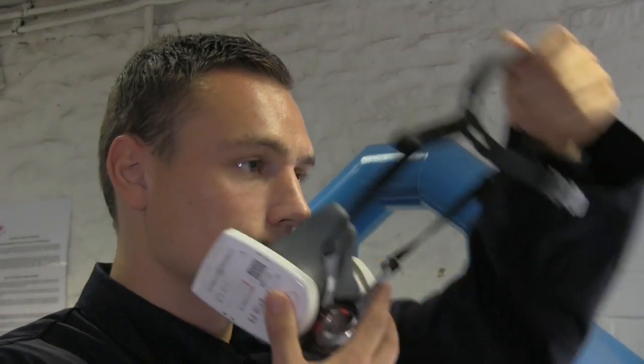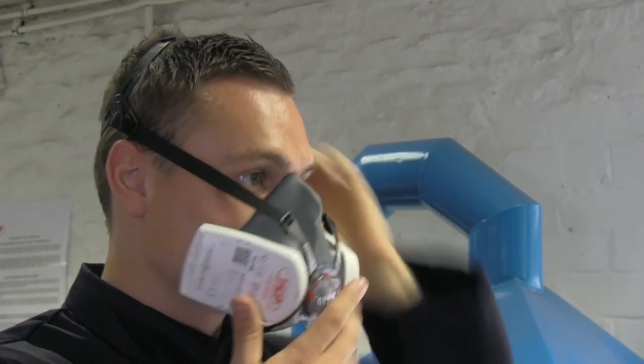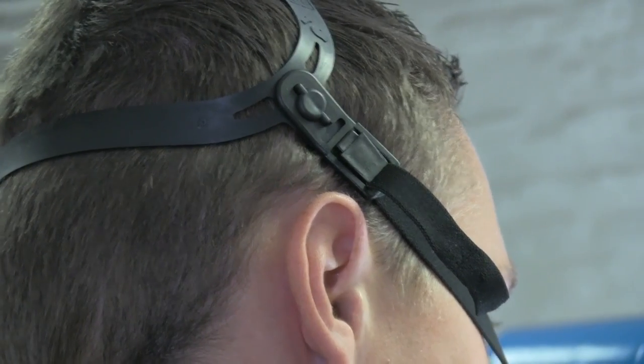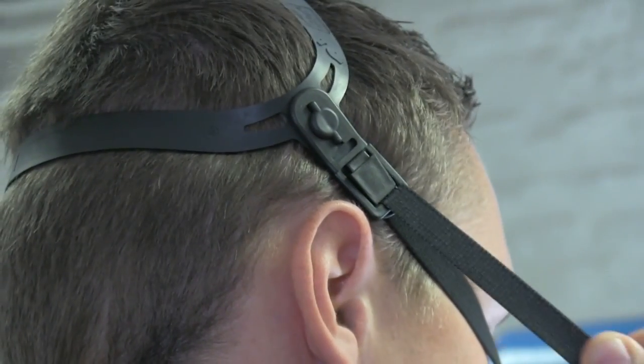So he'll offer the mask up to his face, put the head harness over the top, and then do the neck straps up behind his neck. What Joe is going to do now is adjust the elastic to make sure he's got a comfortable, secure fit of the mask to his face.